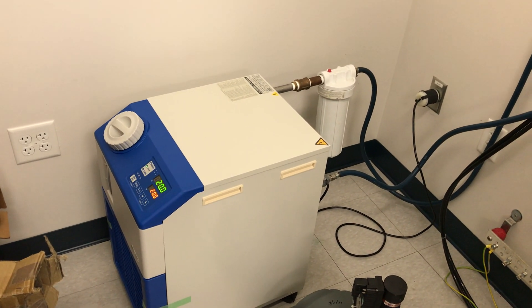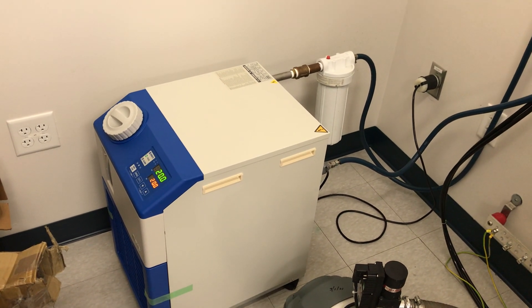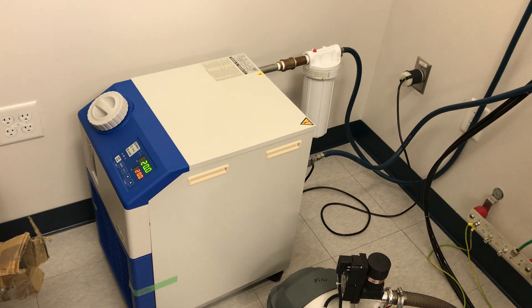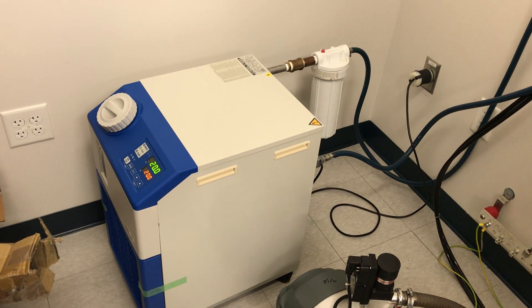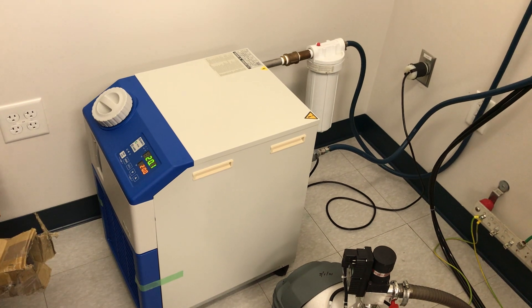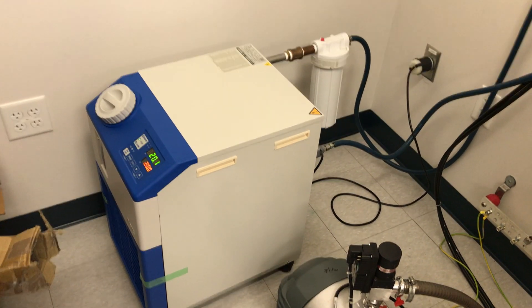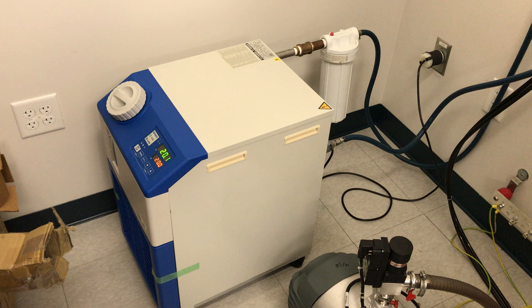The first thing you have to understand is that the reason most electron microscopes — and I say most because there are a small number that do not have a water cooling system — but the vast majority of them do. The reason it's there is to prevent damage to the lenses. The lenses generate a tremendous amount of heat via the current going through the coils, and that heat has to be dissipated. If it's not dissipated, the coils end up frying and your microscope is damaged. So you have to have a way to cool the lenses — that's where your water chiller comes in.